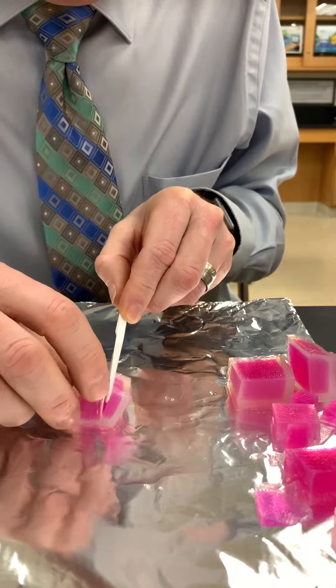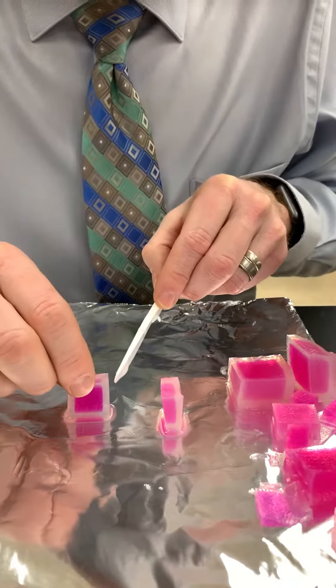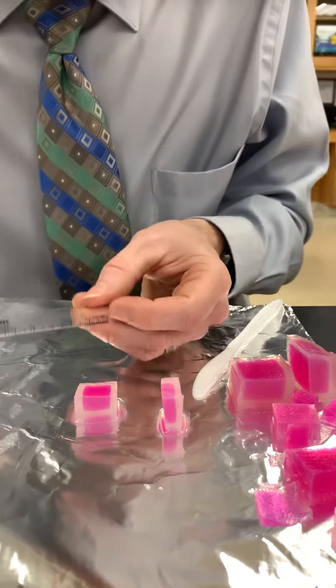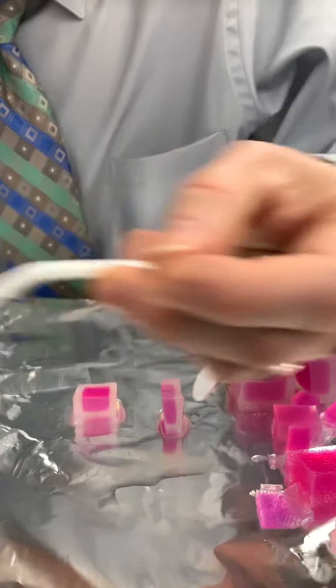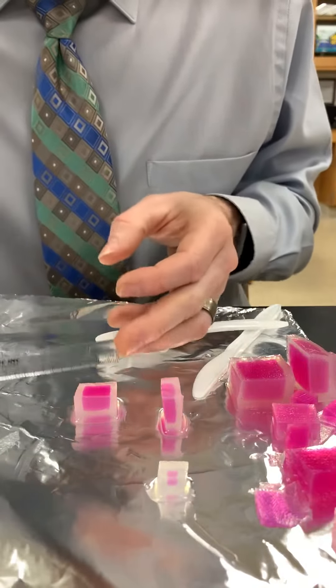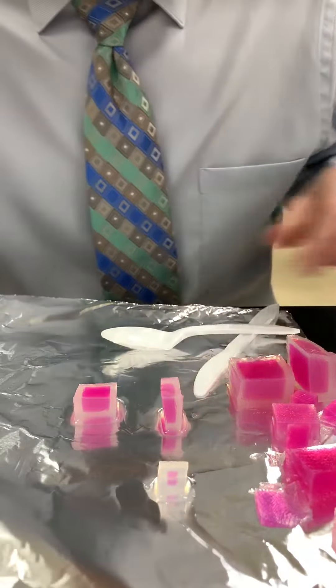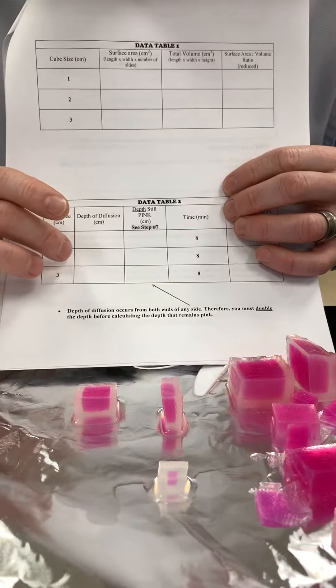You can see the diffusion there. We take our ruler and measure—oh, I need to take the 1x1 out as well. Let me measure, and I get about 0.35. So I'm going to write 0.35 for the 2x2x2.